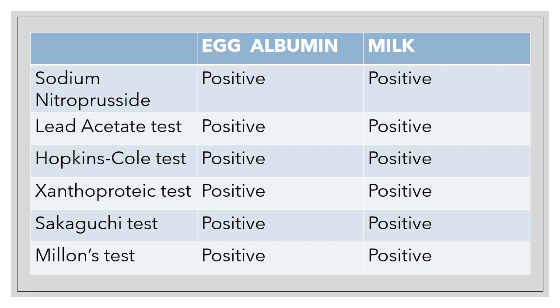Okay, and then another thing that contributes to the difficulty of removing the stain is that it reacts with certain substances to form insoluble compounds that are difficult to remove in normal washing. These compounds adhere strongly to the material, making it challenging to remove. And of course, nitric acid may oxidize or break the molecular structure of a material, leading to discoloration, and that is for the staining of your nitric acid. Okay.